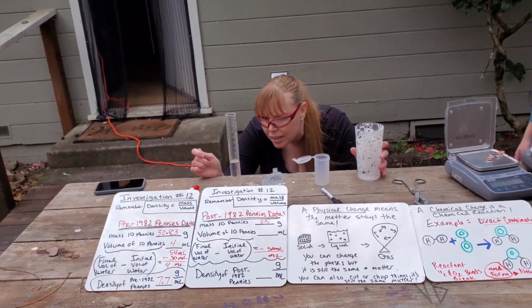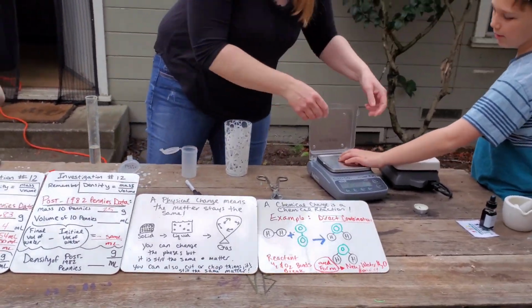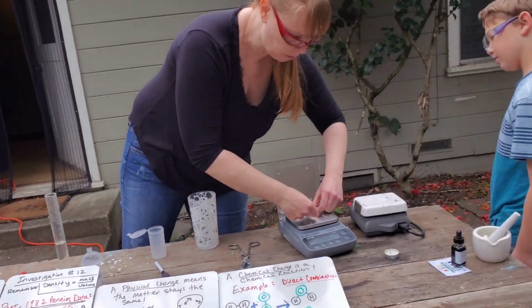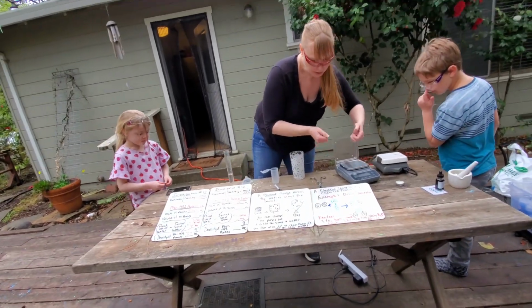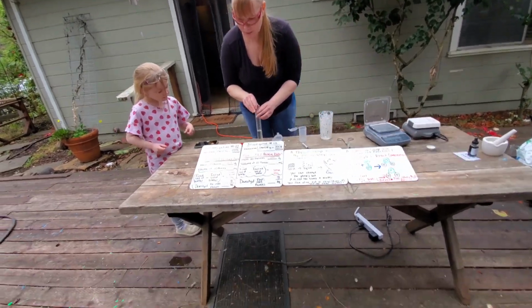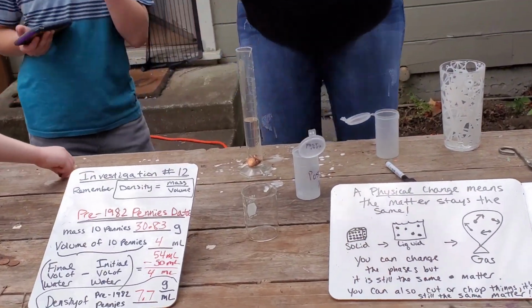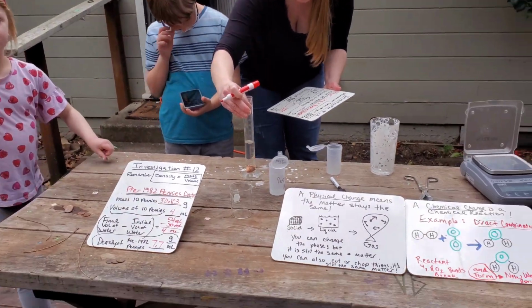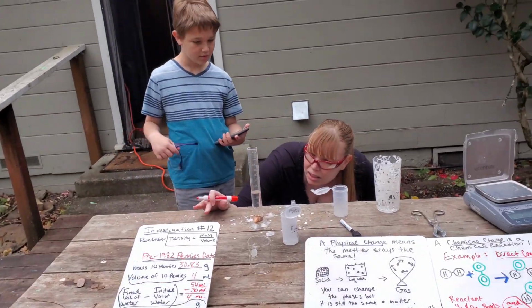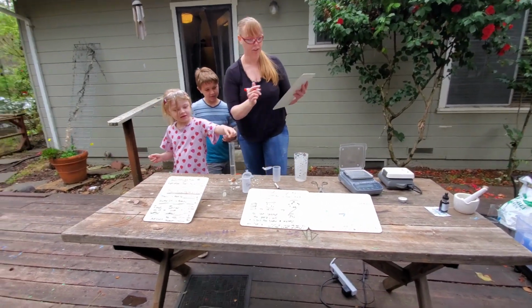Okay, so can you tell me the mass on that again since Joel messed it up? It was 25. 25 still? That's what you said. Yeah, 25. It's still fluctuating just a little bit. Okay, so we have 25 grams, and we're putting it into 50 milliliters, and then we're going to watch the rise. The rise is 51, 52, 53. Actually looks like 53 milliliters.